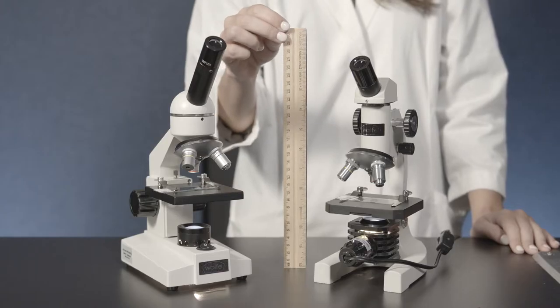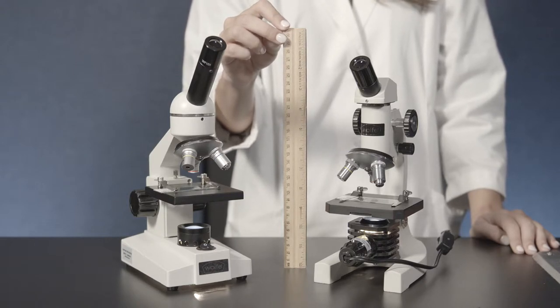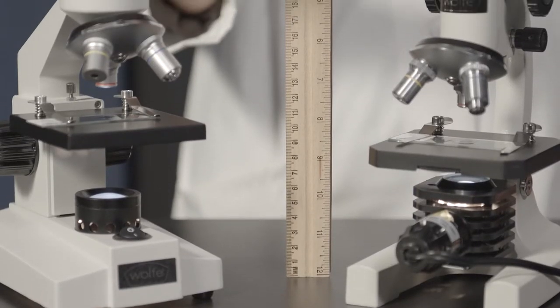Traditional compound microscopes that are designed for students in lower grade levels are usually referred to as three-quarter-sized microscopes. The lighter weight and smaller size, usually about 11 to 12 inches high, are easier for younger users to handle.